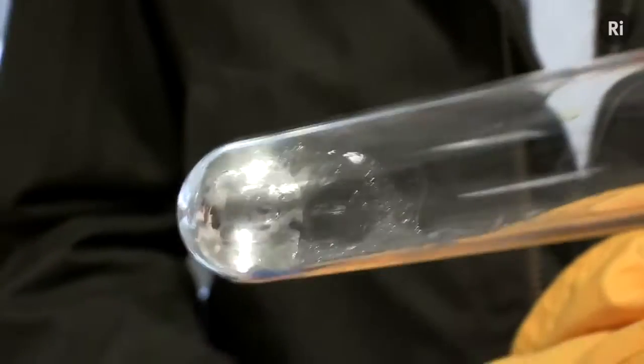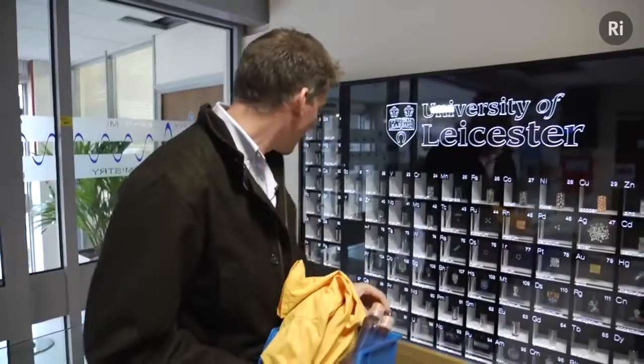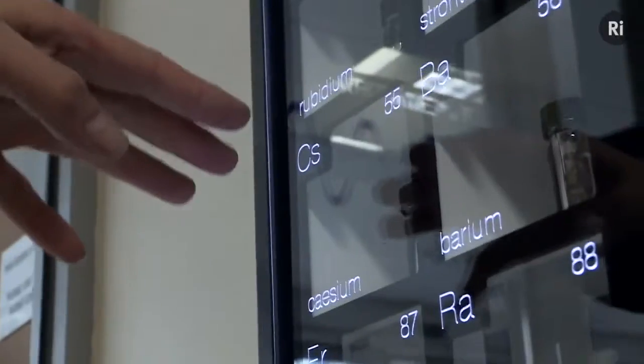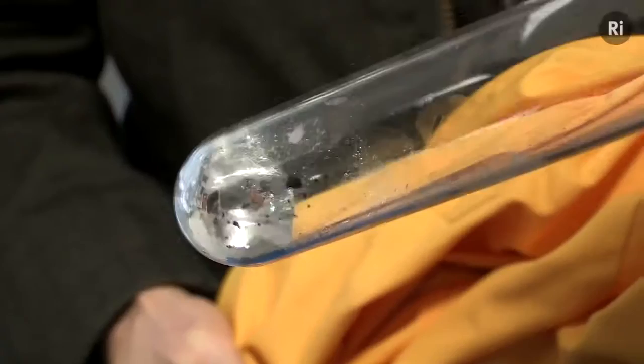I've come to the University of Leicester with a tube containing caesium. Caesium is the most reactive metal in the entire periodic table, even more reactive than francium. This is a radioactive element that decays, but caesium is more reactive than this. It's the most reactive thing we can find.